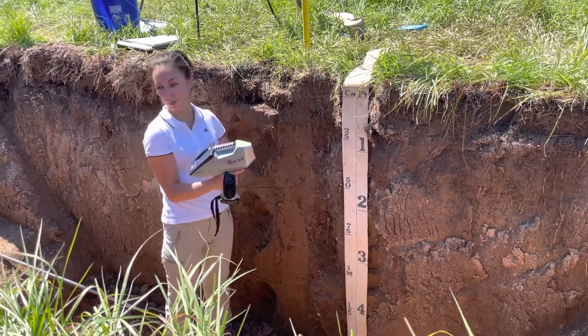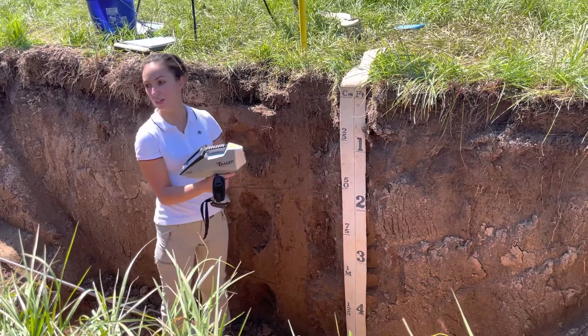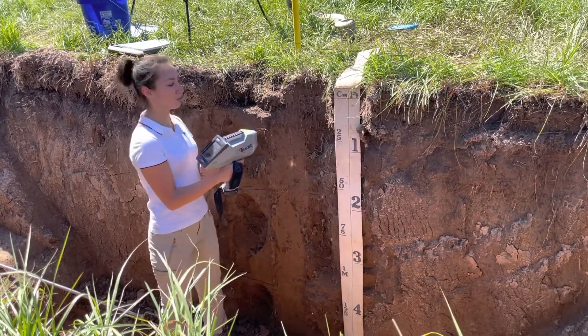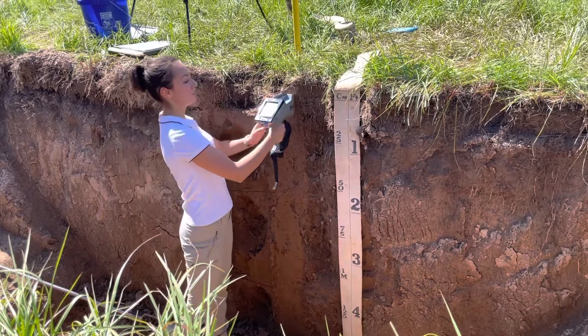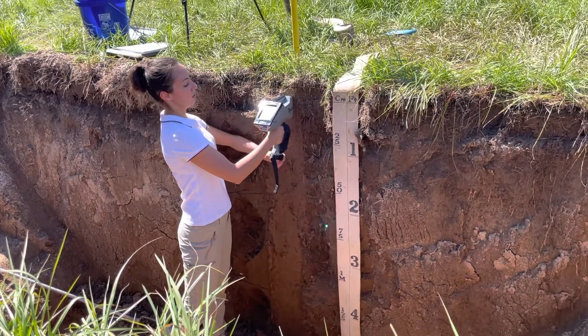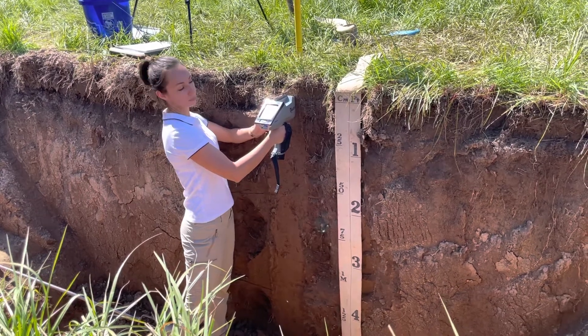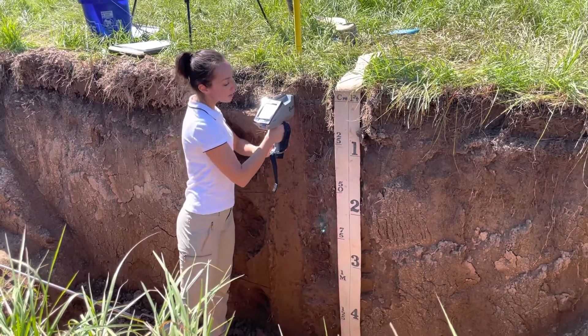The longer, the better. So which is the first horizon? Zero to nine centimeters. All I do is press the trigger, putting it against the clear wall, and it's analyzing.